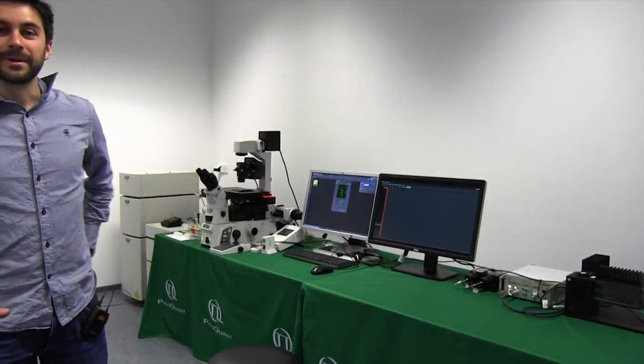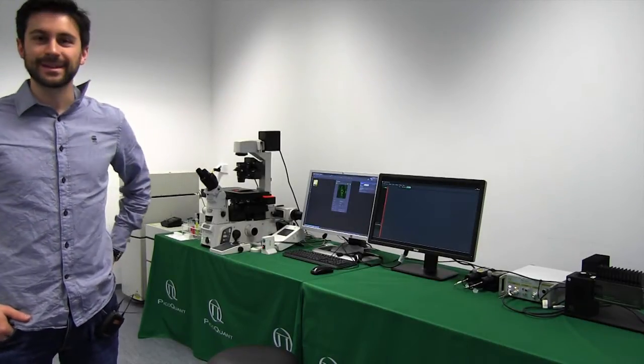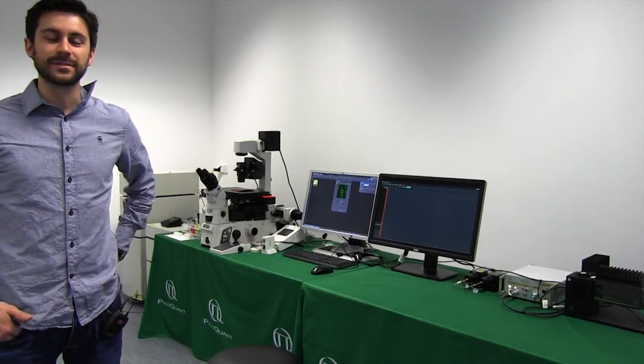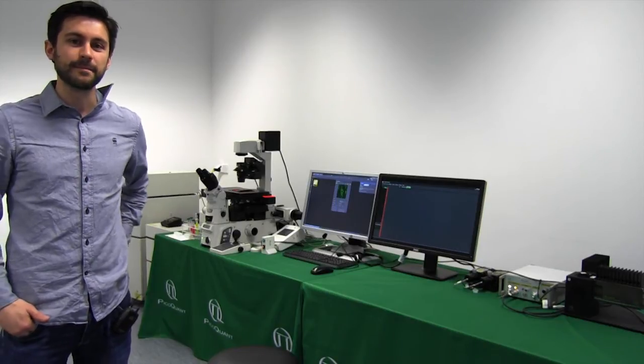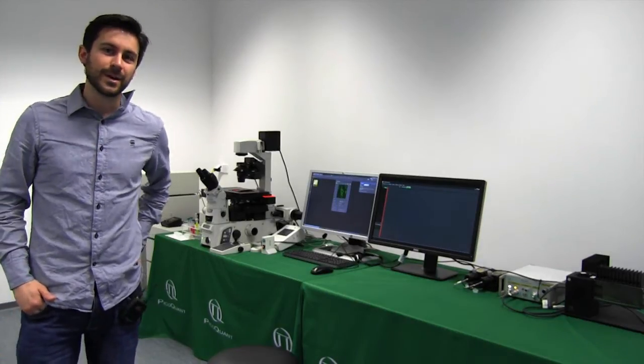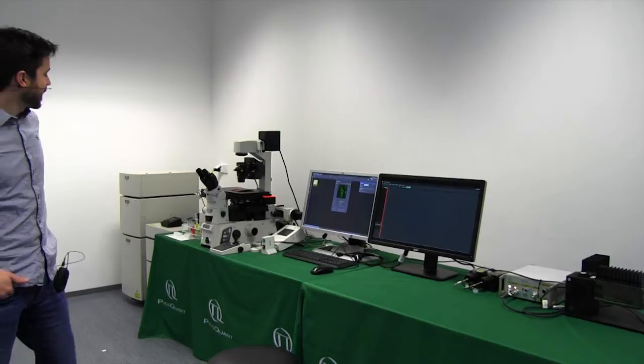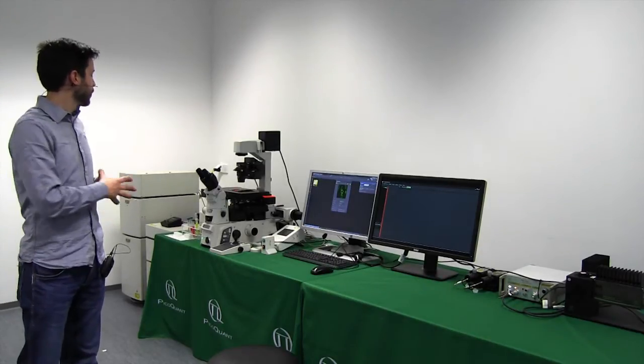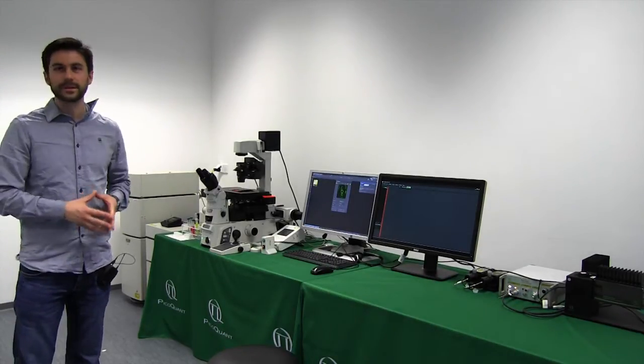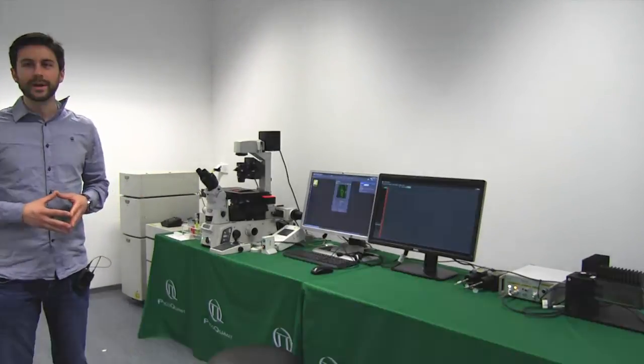Hello, my name is Manuel Vega from PicoQuant and today in this video I would like to show you how to make a FLIM measurement with the A1R system, a confocal system from Nikon upgraded with PicoQuant.